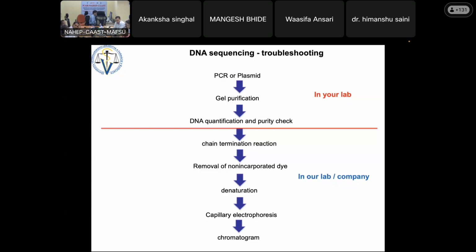It is also my hobby to maintain the machine. I have two technicians, both girls, and they are really amazing at maintaining the machine. But if something is wrong in the capillary, I accompany them to clean the machine and so on. So there could be a lot of problems in the machine or the Sanger chemistry as well.